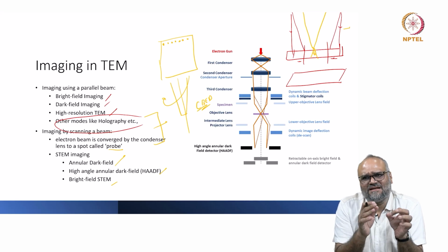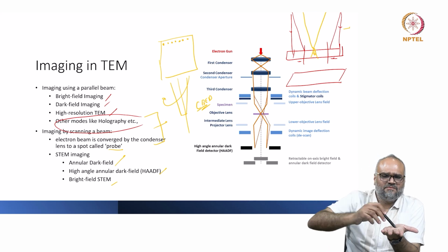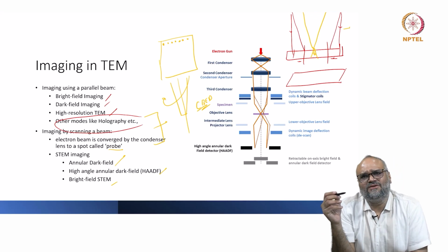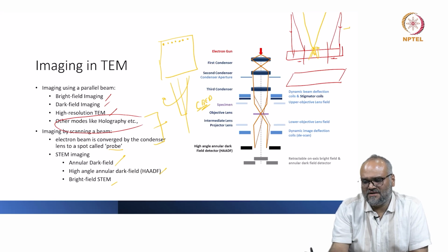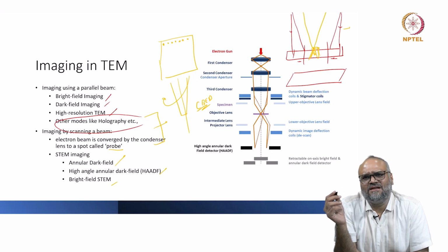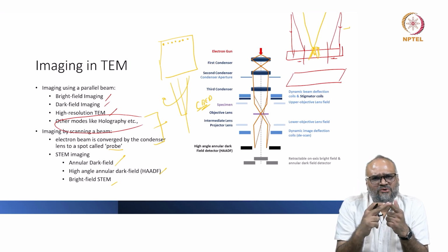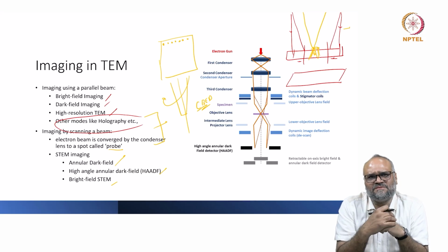You have a slight width, a slight diameter to the probe tip, and you intentionally precess the probe with a small angle, and you can collect the information from a sort of truncated conical area from a specimen. All these methodologies give you different kinds of information from the specimen, and essentially you get the compositional, morphological, crystallographic, and structural information from a specimen.